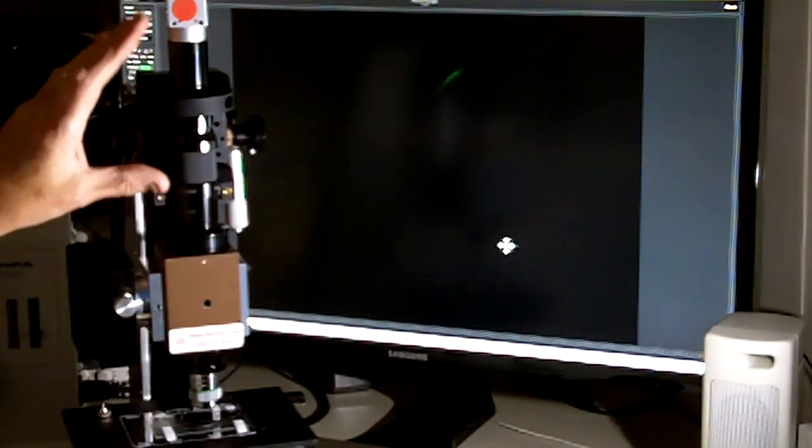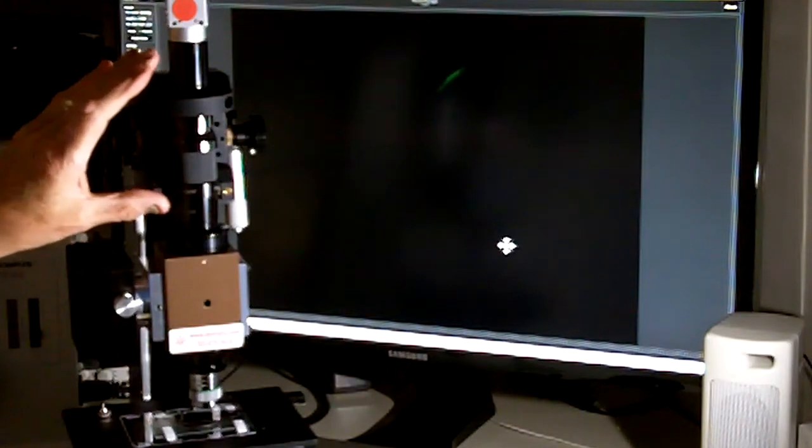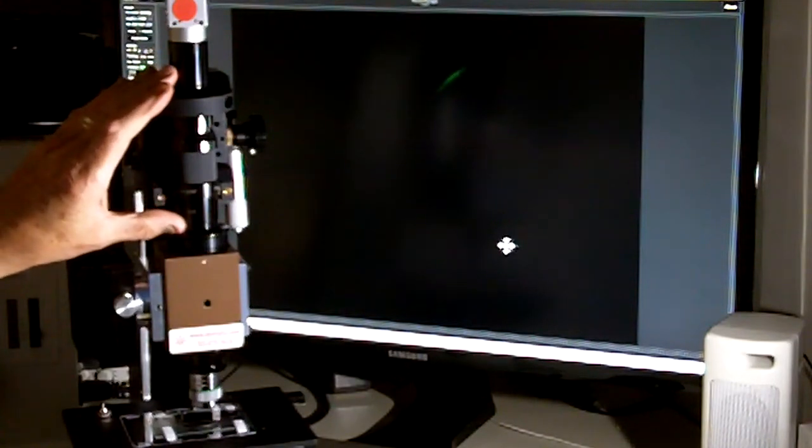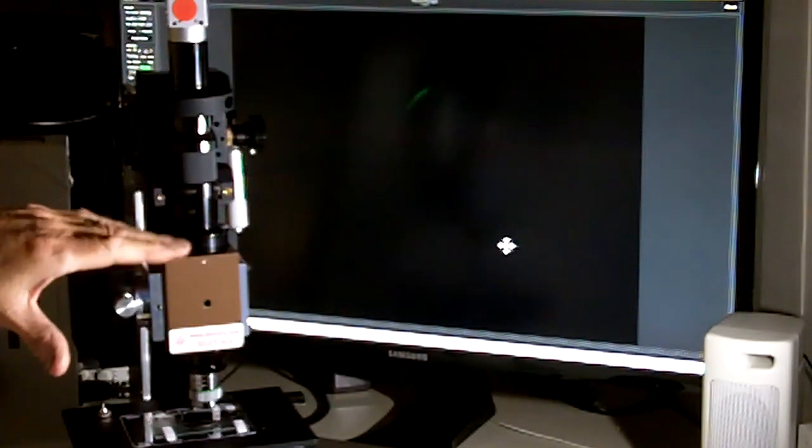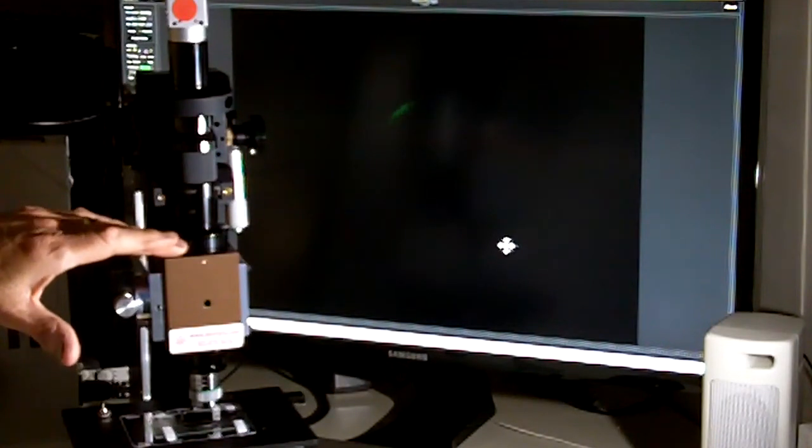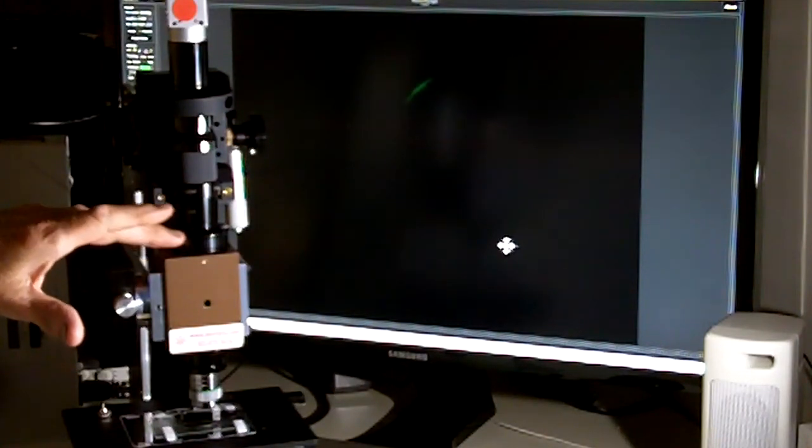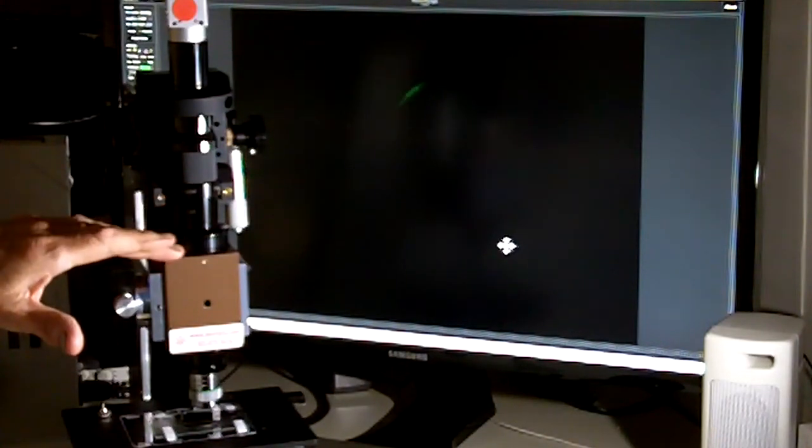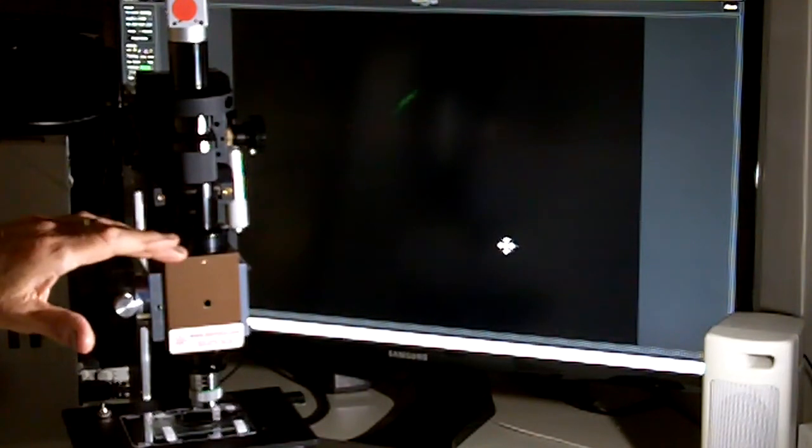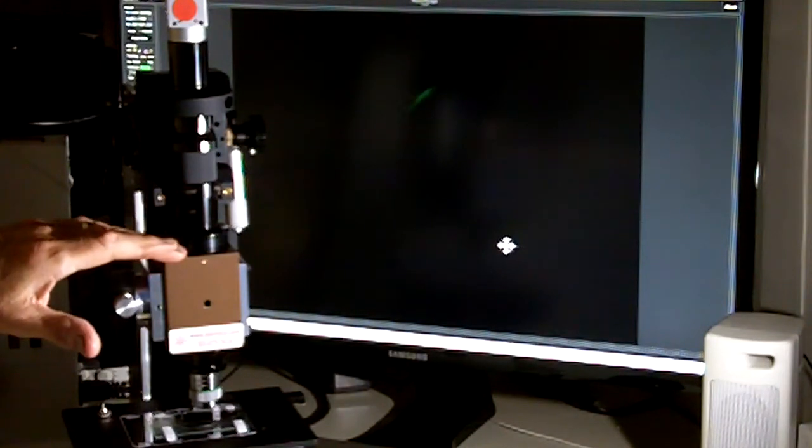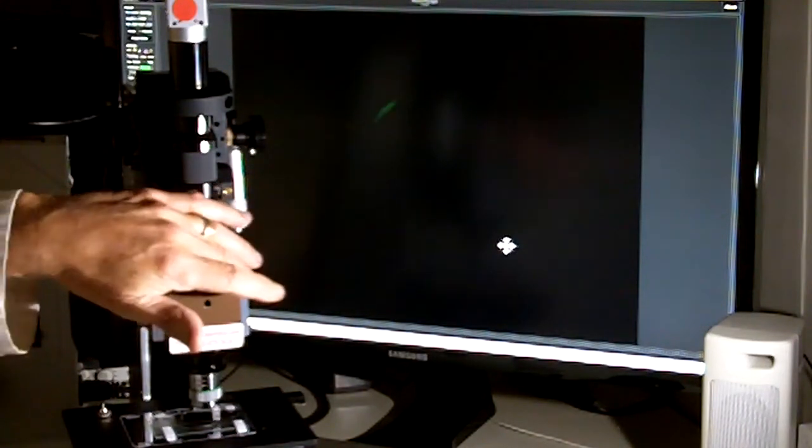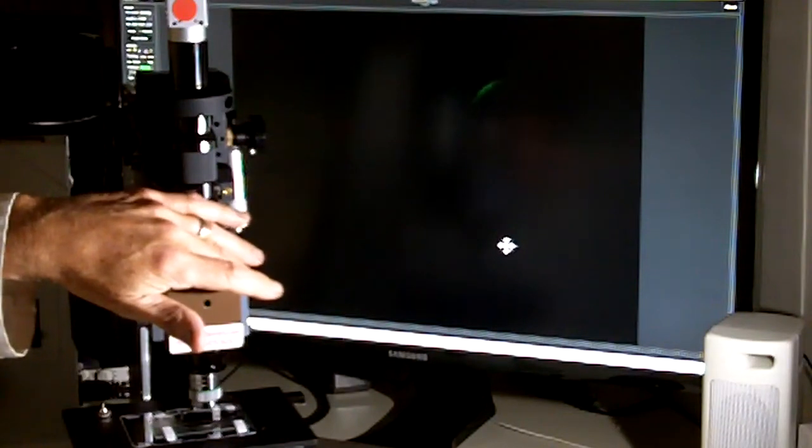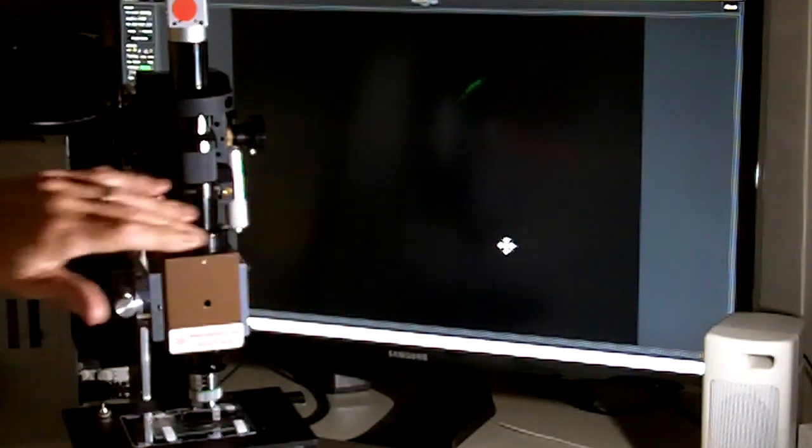So here you see the KC configured. And the reason we use the KC, Bunton has their own filter cube housing, so-called plume illuminator. And the plume illuminator allows you to quickly interchange filter cubes to go from blue light excitation to green light.